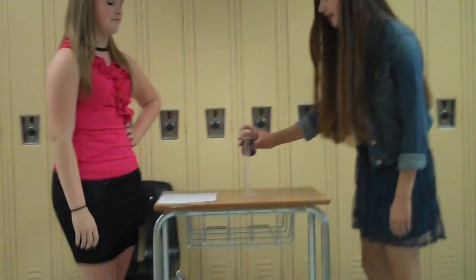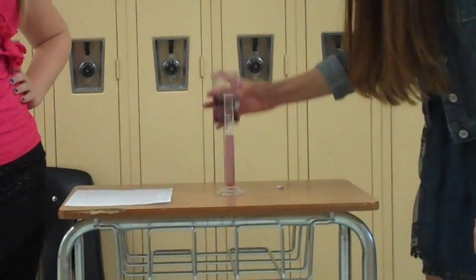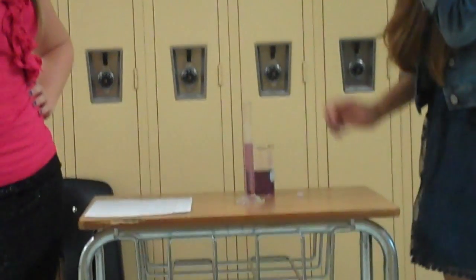And I'll demonstrate how to use it. I'm going to pour water in the graduated cylinder. And to read how much water is in there, you have to read the line that's beneath the meniscus.